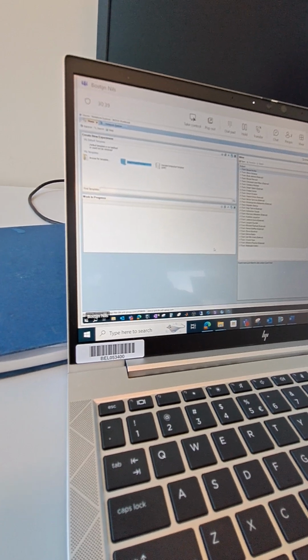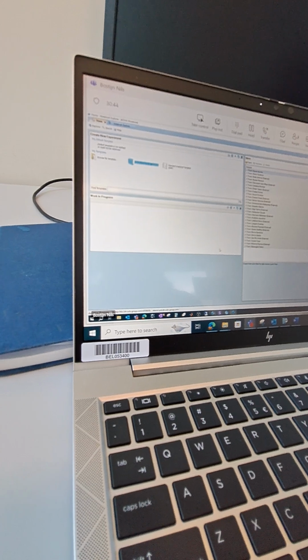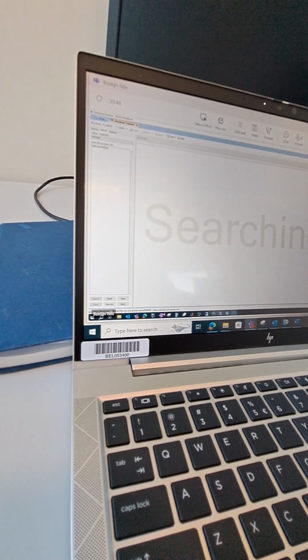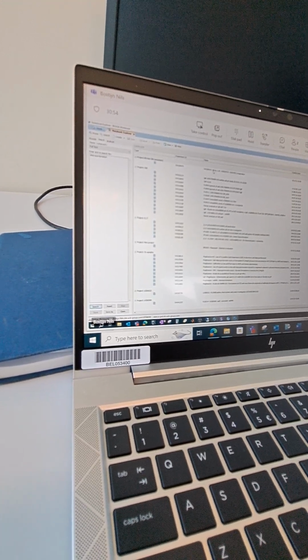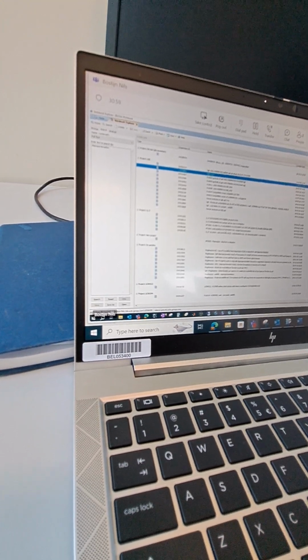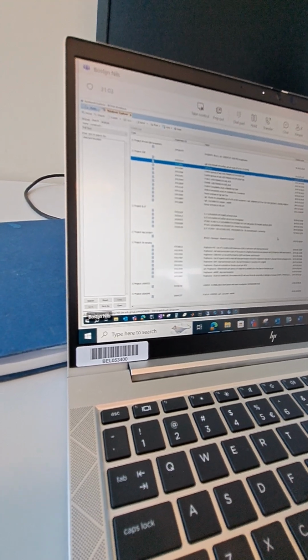I don't know if you have other questions. No, just these. The rest I'm fine. But you see, it's still searching because there are a lot of ELNs. You see disproportionation, and I think if the word is written somewhere in the ELN, it will show up here.